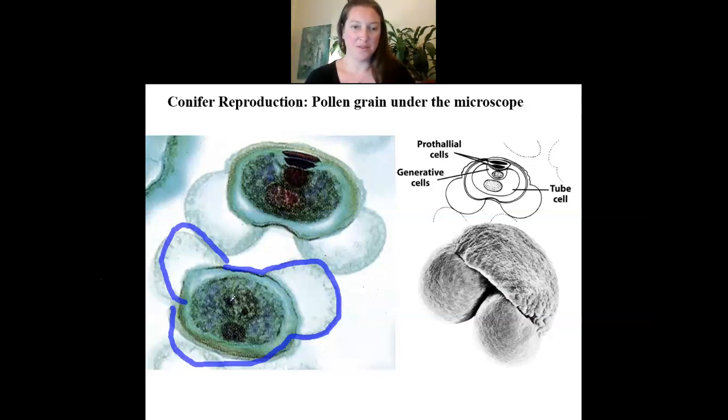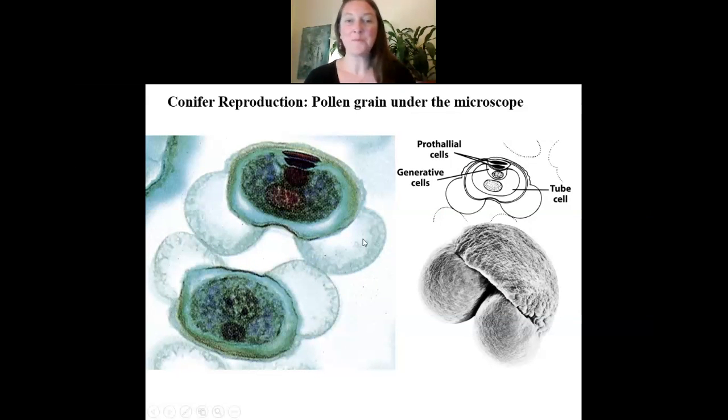Mickey Mouse. Look, here's the eyes. Oh, well. You get the idea. Yeah, so here's what pollen grains look like under the microscope. Similar to the pollen grain we already talked about before, it's basically a few cells. So the male gametophyte plant has now just been reduced to a few cells. You don't need to know the name of the cells.